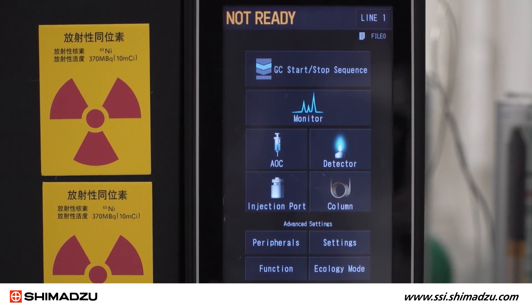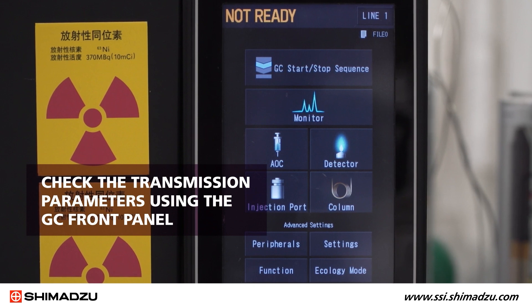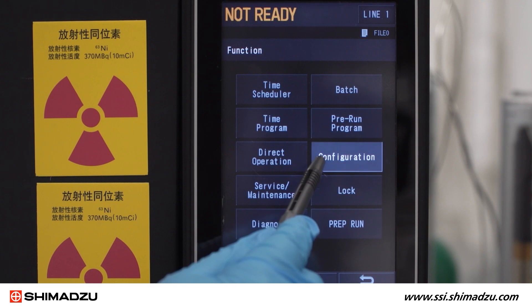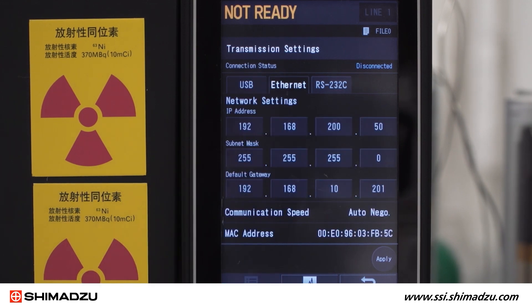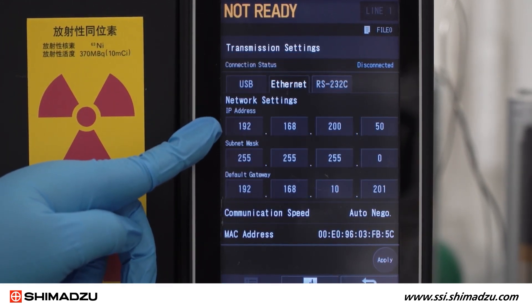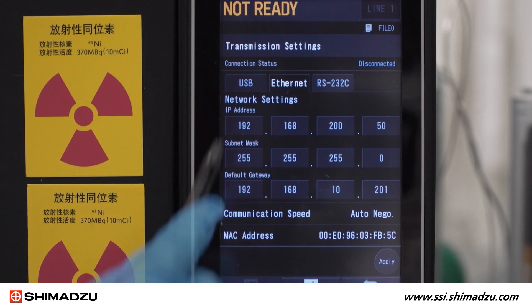If there is an issue connecting your GC to your control software, check the transmission parameters using the GC front panel. From the home screen, select Function, then Configuration, then Transmission Settings. Select USB or Ethernet, depending on your system connection type. If you are using Ethernet, check the IP address to make sure that it matches the IP address listed in the system configuration in your software. Here, we are using USB.